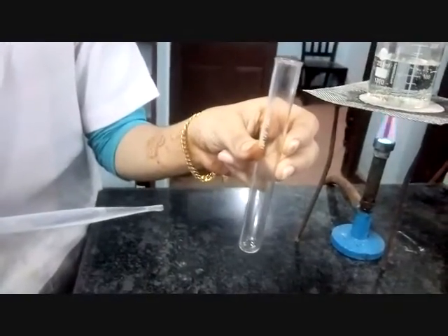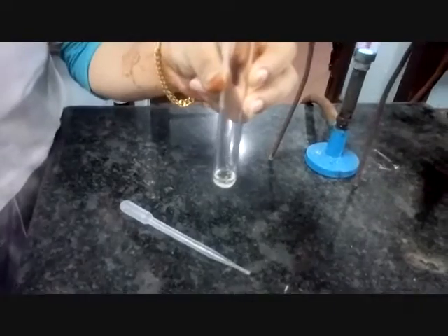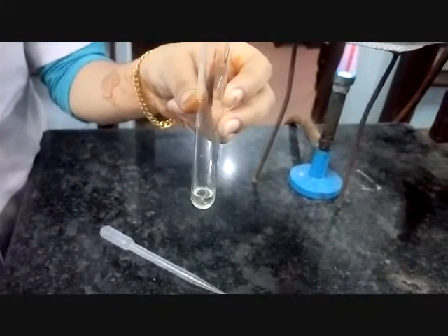Nitration test. To a mixture of 1 ml concentrated HNO3 and 1 ml concentrated H2SO4 taken in a test tube, add a little of the compound.